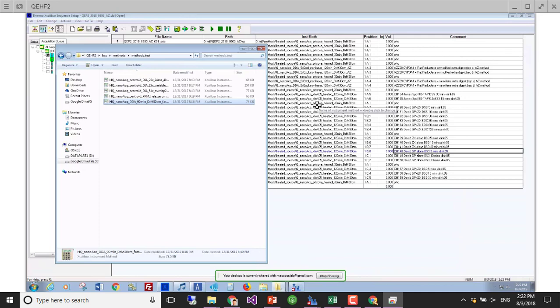Is that true? Anyone not done DDA? Okay. Clearly, I can't double click on things. That's better. My goal here is to not crash the computer while Alex is trying to collect data.